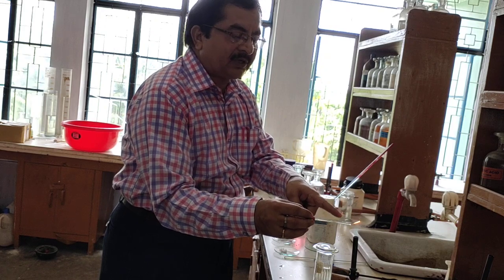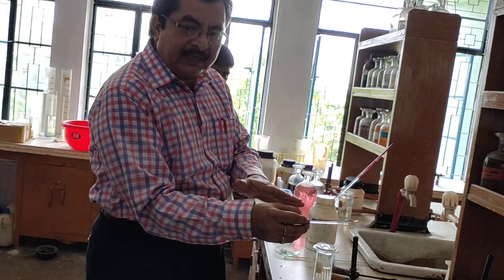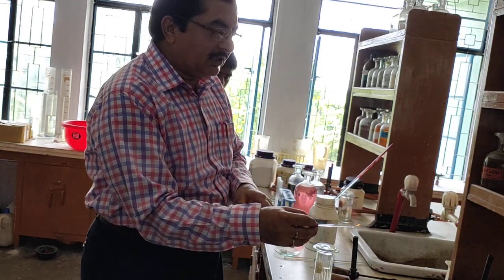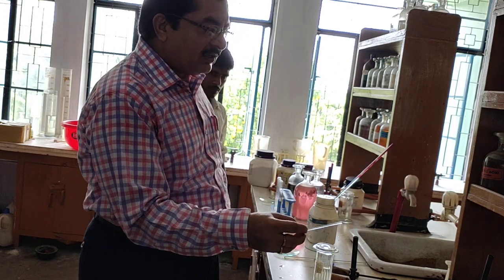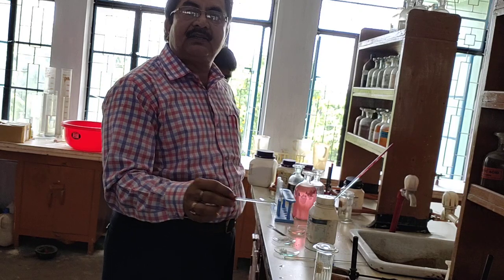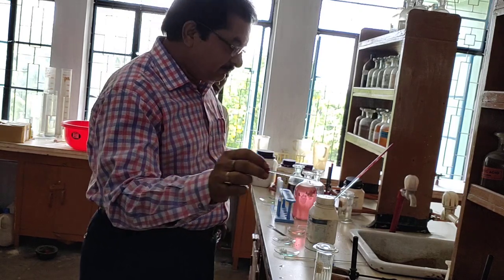Alright, we cannot confirm it now because there are so many other tests also there. But for barium, the flame test is one of the best confirmatory tests of barium. So in this way, you have seen how, by the help of the flame test, we can say that this salt maybe, means that it is mainly for basic radical. Flame test is mainly for basic radical.